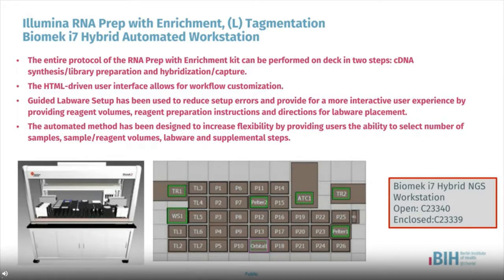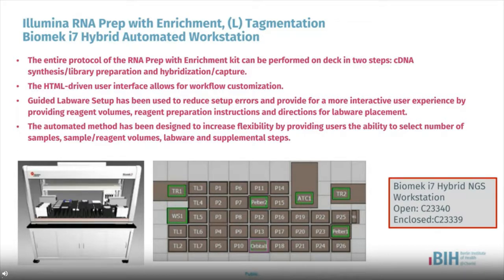The Illumina RNA Prep with Enrichment application is a demonstrated method for the Beckman-Coulter Biomek i7 hybrid liquid handling platform. Shown here is the deck layout for the Biomek i7 NGS workstation, which is equipped with 26 automated lab work positions, 7 tip loading positions, an active wash station, orbital shaker, both static and shaking eco-pelletiers for active plate heating and cooling, and an integrated Applied Biosystems automated thermocycler.